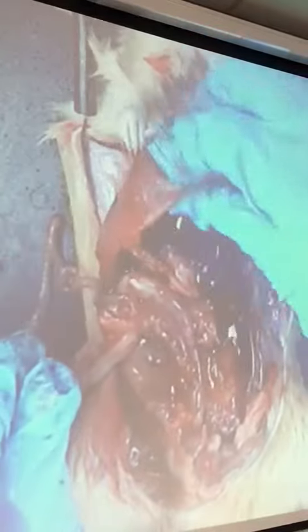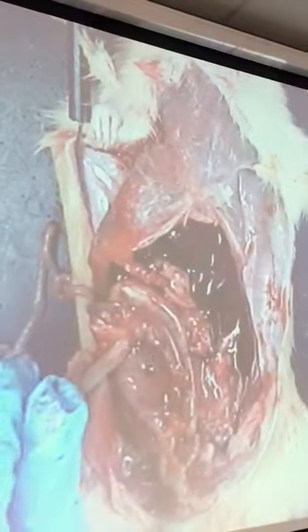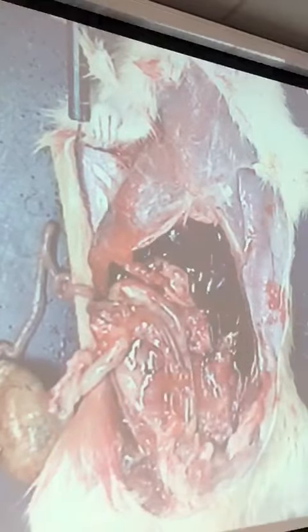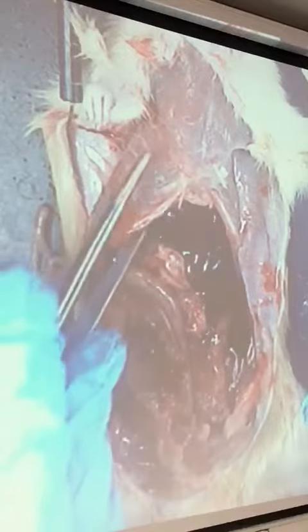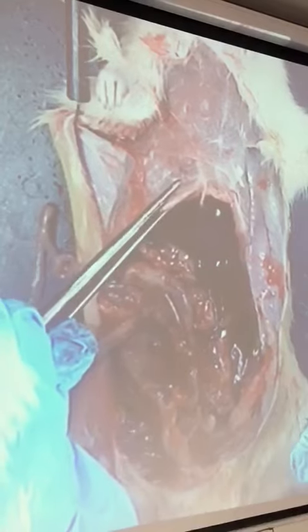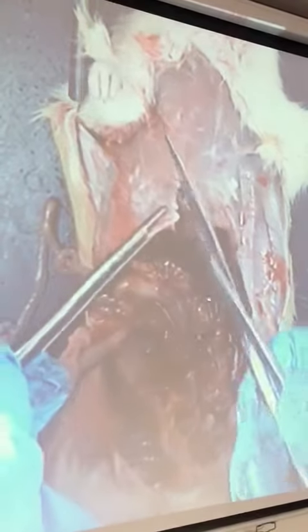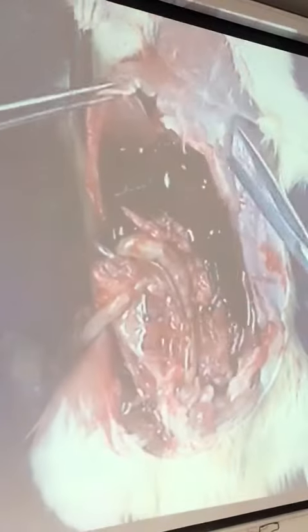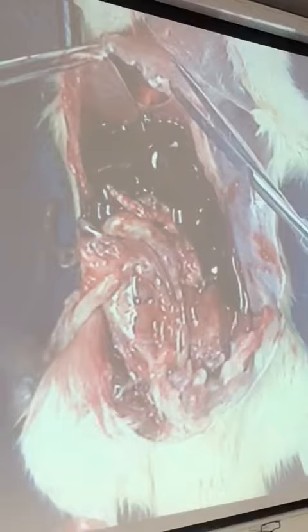We're going to cut up the ribs and the sternum to expose the thoracic part. We've got to use the same skills that we have before — we just use the force. Lift the ribs. These are a little bit harder because the ribs are bone, so you lift harder. But when you lift it, you can see the diaphragm. Can you see the diaphragm there? I'm going to cut the diaphragm.